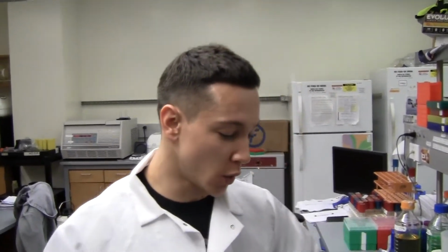So lysogeny means the genome incorporates itself into the DNA of the E. coli. The lysis-lysogeny decision means that the lambda phage has to decide whether it will incorporate its own genome into the E. coli genome, or whether it will just go lytic and make more of itself. So when we have C1, it goes into lysogeny. So hopefully what we're going to see here is when we have our C1 and we add lambda phage, our cells will live.